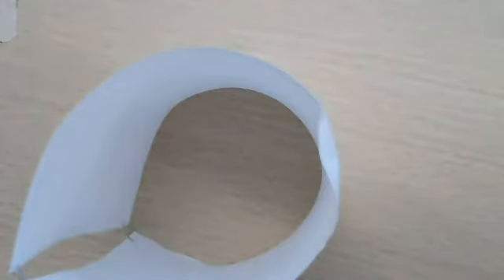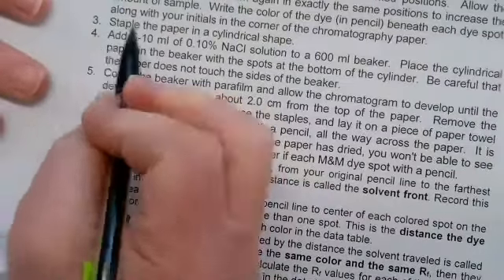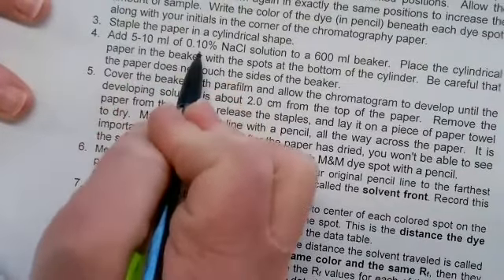Okay, so that's our stationary phase, and we have our samples. At each of your stations, I already have a large beaker that contains the salt solution. So number 4 says add 5 to 10 milliliters. It's already added for you. It's already ready to go.